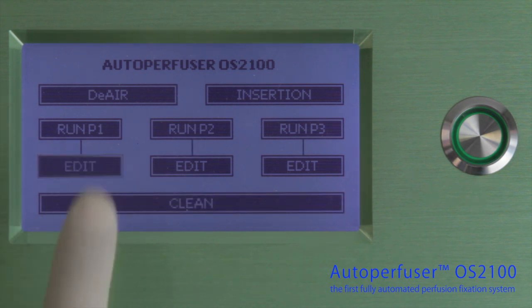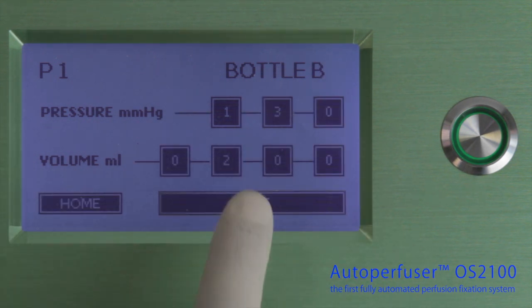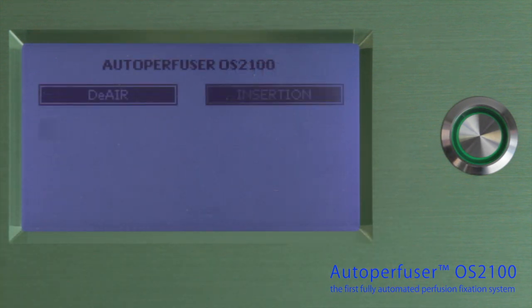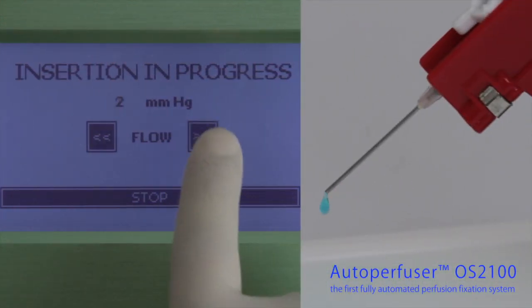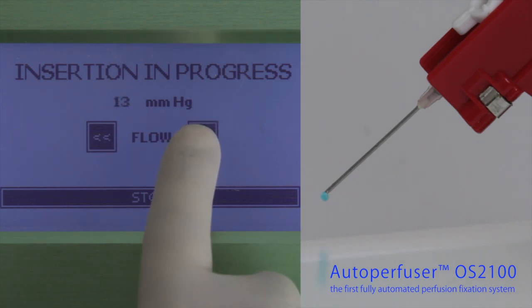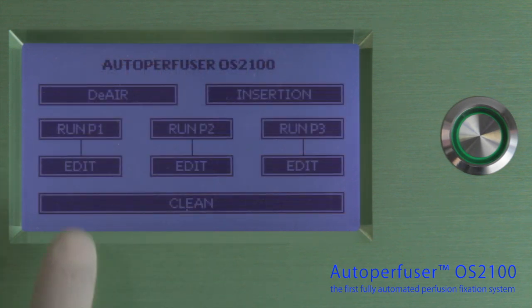Typically, you start the program by entering the desired pressure, volume, or duration of the perfusion. Then you press the insertion button and adjust the pressure to obtain a suitable flow while you are preparing the animal to be perfused. When you are ready to perfuse, press run.